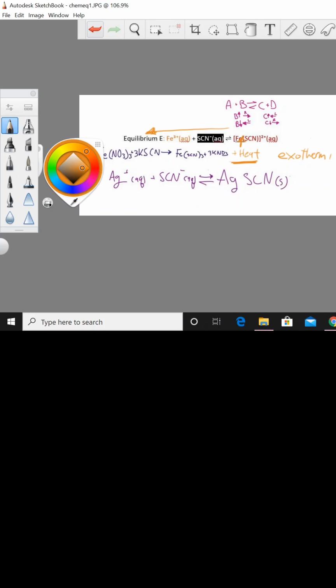So the last part that we did for this part E was when we added AgNO3, which caused our test tube to become white. Well, it was more like a sort of clear with precipitate in it to make it look like a cloudy white sort of color.